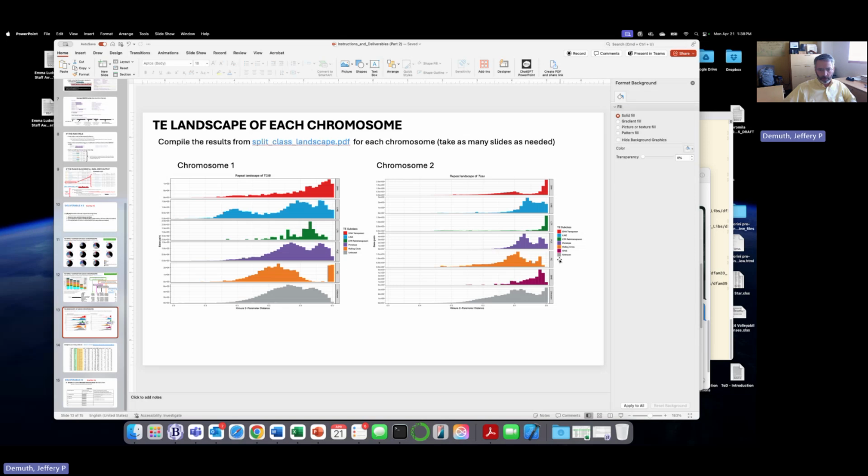If you remember back to the intro material on transposable elements, those that have lots of copies that have zero divergence, and these graphs are a little strange in that the zero is on the right-hand side of the scale. But things that have more transposons down here that are more similar to each other, like the DNA transposons in this genome, have been fairly active recently.